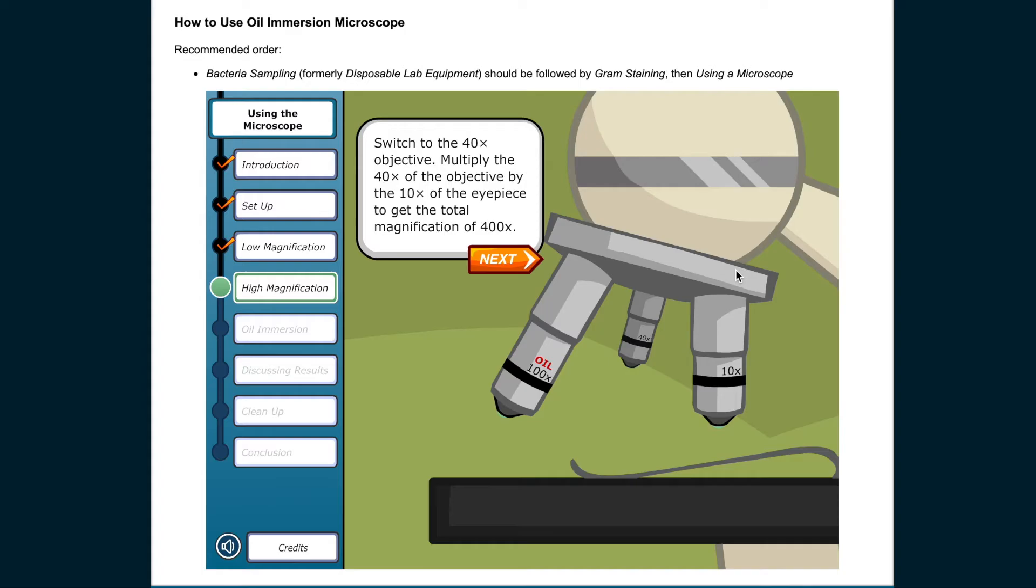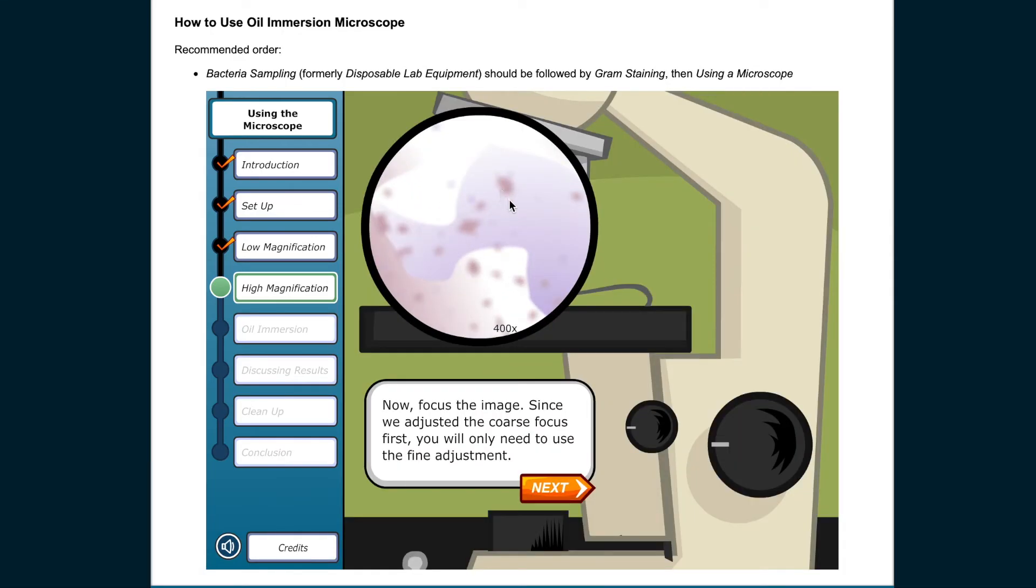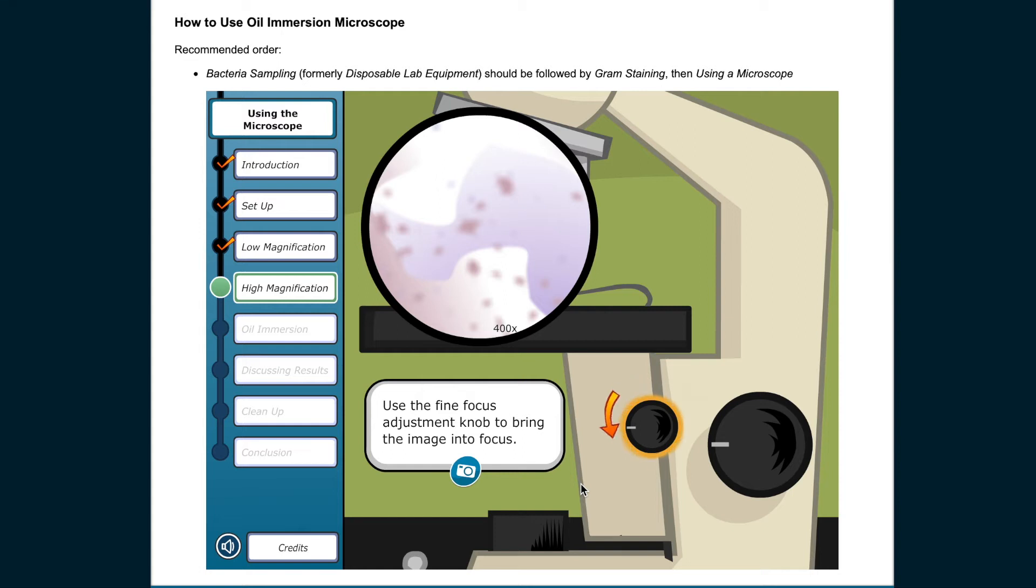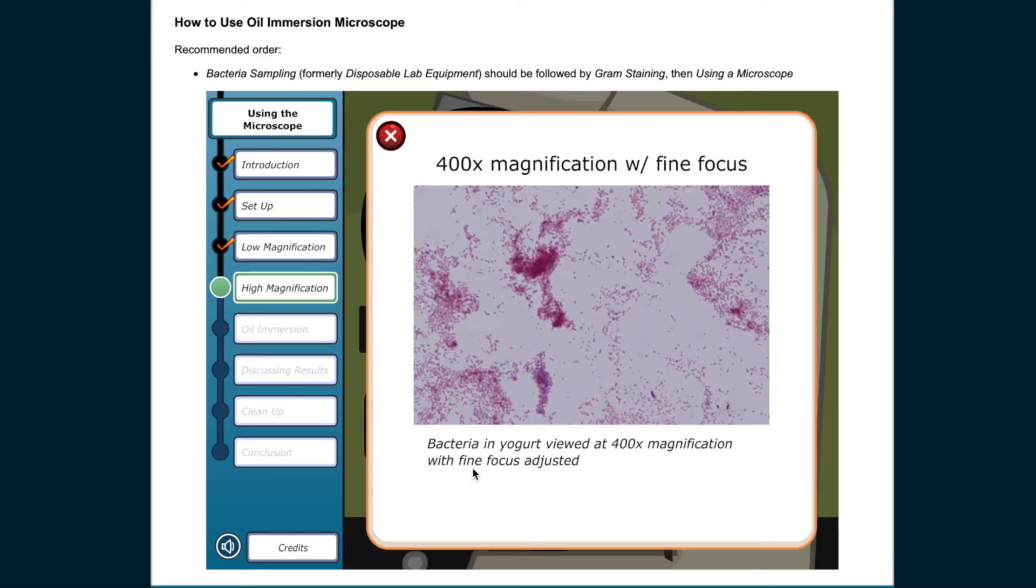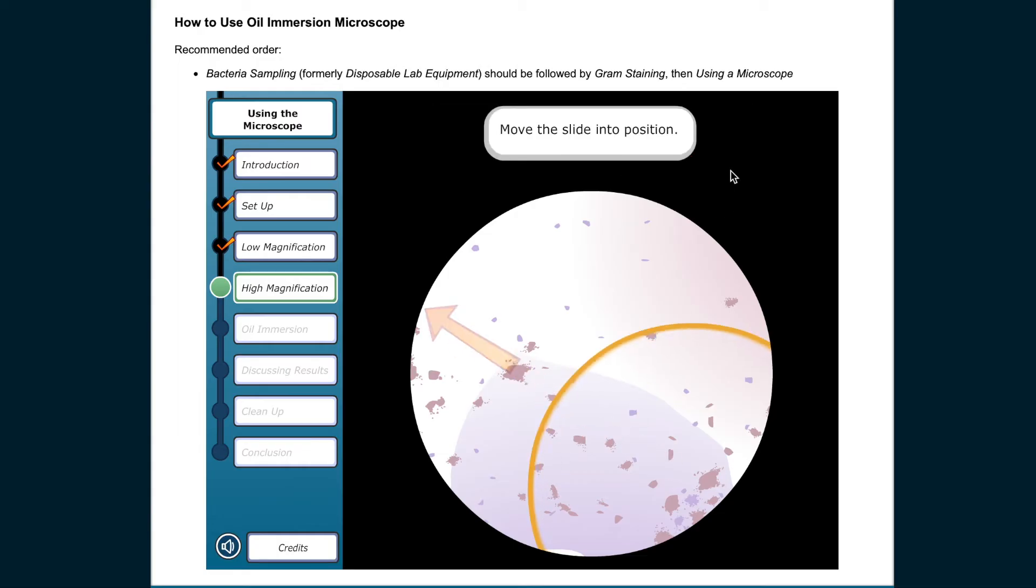Switch to the 40 times objective. Multiply the 40 times of the objective by the 10 times of the eyepiece to get the total magnification of 400 times. Rotate the nose piece to the 40 times objective. Now focus the image. Since we adjusted the coarse focus first, you will only need to use the fine adjustment. Use the fine focus adjustment knob to bring the image into focus. Slightly adjust the slide on the stage for the best possible view of the bacteria through the eyepiece.